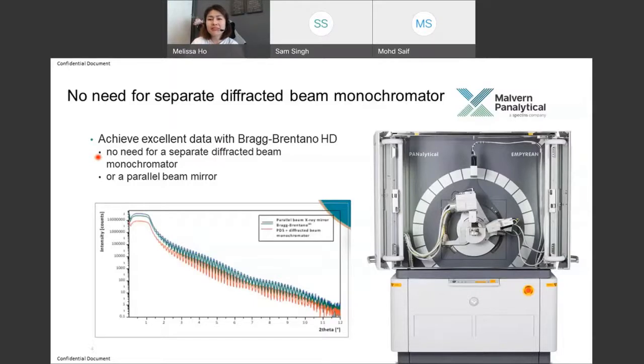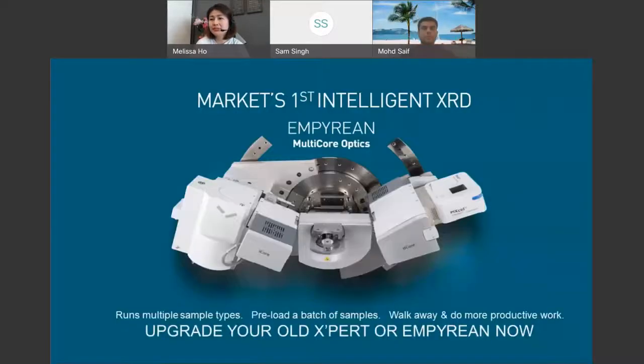These are amazing advances in technology that we are offering to help you keep up with your pace of R&D. All these are available on our latest XRD platform known as the Empyrean. Malvern Panalytical is the first in the market to offer an intelligent XRD platform. Not only do you get all these amazing optics and detectors, but with our multi-core — what you see on the screen — this is the feature we are so proud of. It's an automated feature.